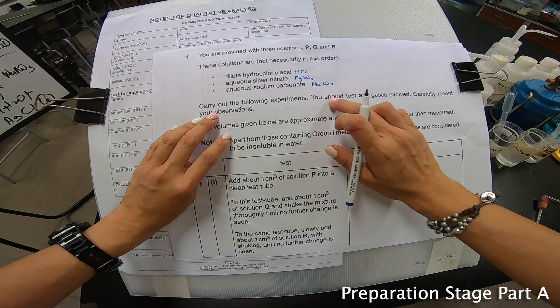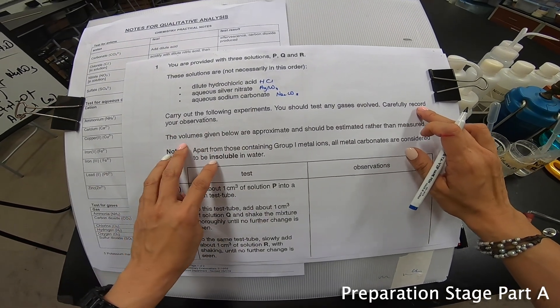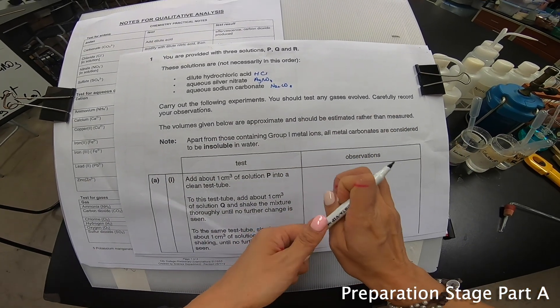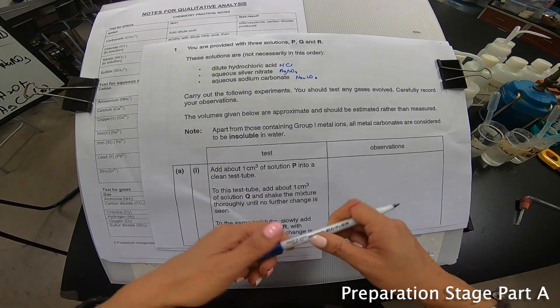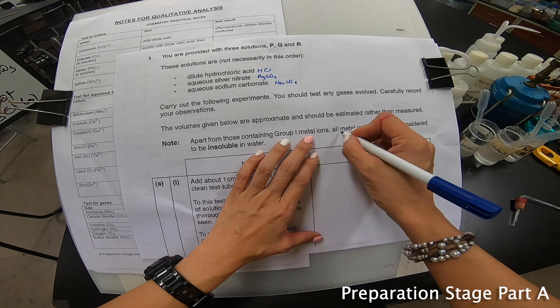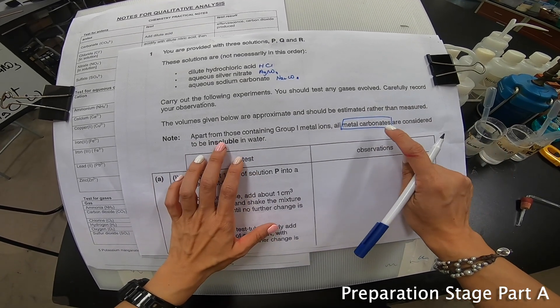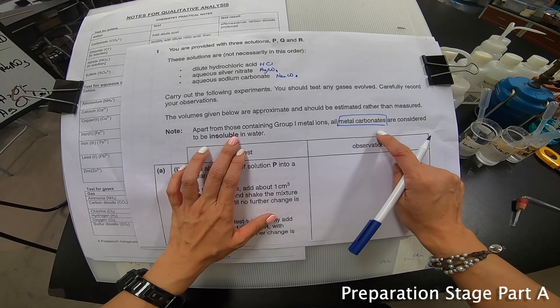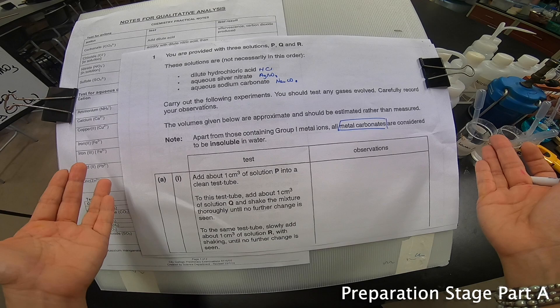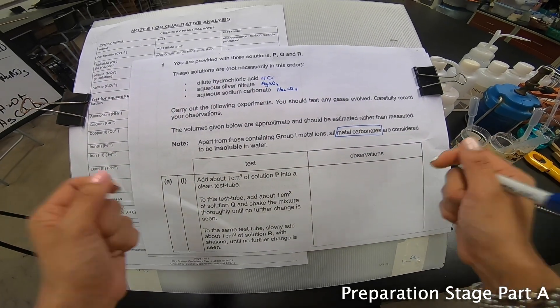Carry out the following experiment and you should test any gases evolved. Carefully record your observation. The volume given below are approximate and should be estimated rather than measured. Apart from those containing group 1 metal ions, all metal carbonates are considered to be insoluble. This is a very good hint. But doesn't matter, let's move on because, as I always say, we start with PE. P stands for preparation and E stands for execution.